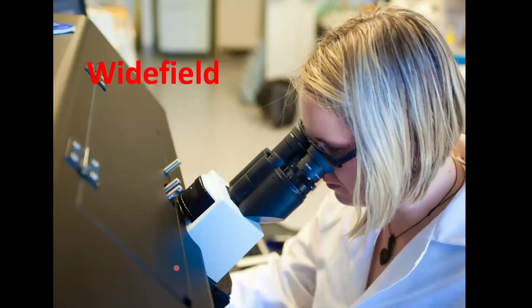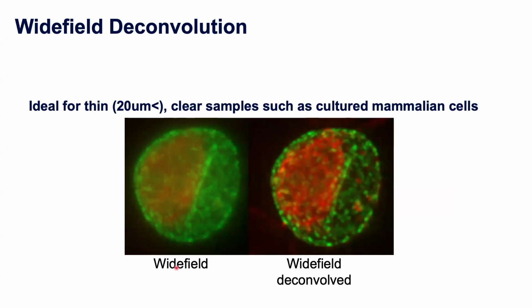Next thing I wanted to cover was wide field. So we're going down in the scales and getting more to the cellular level now. So we went through a wide field or epifluorescence microscope last week, and we touched a little bit on image deconvolution. So using a mathematical formula to reassign the out of focus light back to its starting point.